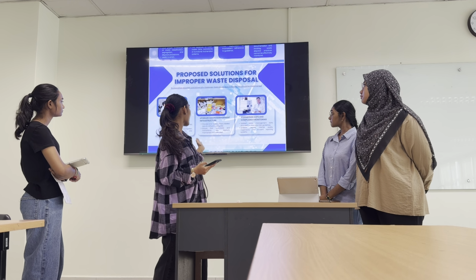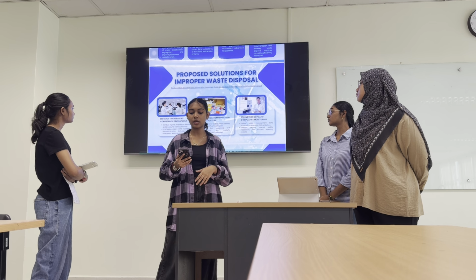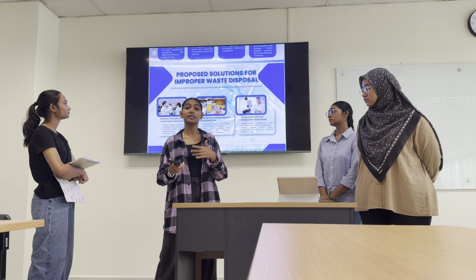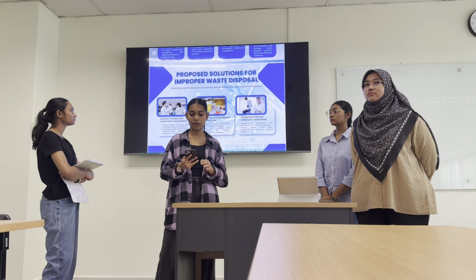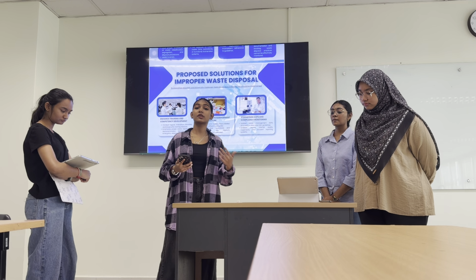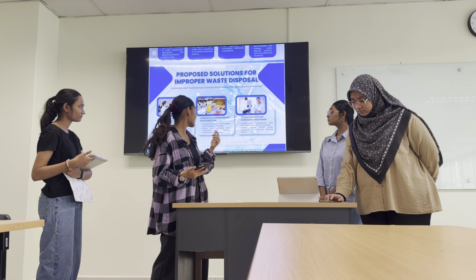And next is to upgrade the waste management infrastructure. The laboratory should provide equipment, color-coded and clearly labeled bins so that various waste types can be thrown away properly. The autoclave should also be routinely maintained, calibrated and inspected so that it will function properly. Next is to strengthen the SOPs and compliance monitoring. The waste management guidelines must be regularly updated based on WHO and CDC standards. Regular internal audits, inspections and an incident reporting system should be enforced to ensure compliance.